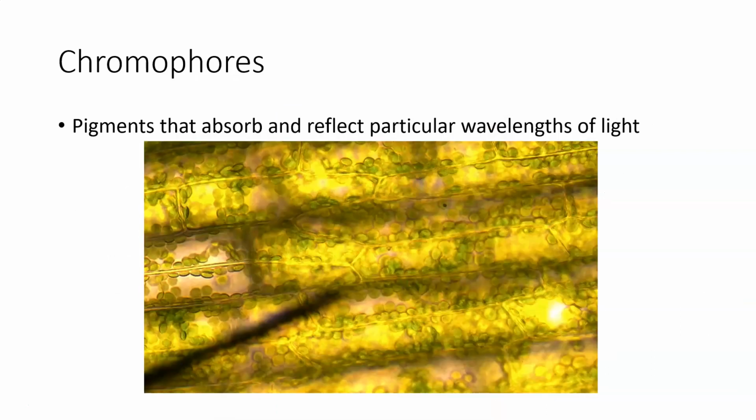Other things that are kind of relevant, when you first start to view objects under a microscope, they have very low contrast for the most part.